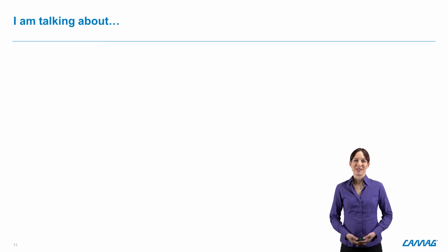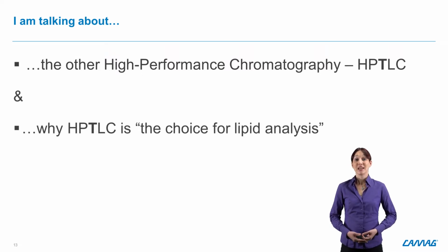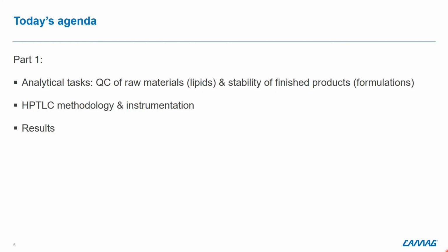I am talking about the other high-performance chromatography, HPTLC, and why HPTLC is the choice for lipid analysis. I would like to show you the results obtained during a feasibility study done together with one of the leading manufacturers of mRNA-based vaccines. First, I would like to give you a brief introduction on the analytical tasks, then explain the methodology and which instrumental setup is recommended, and then I will present the results.